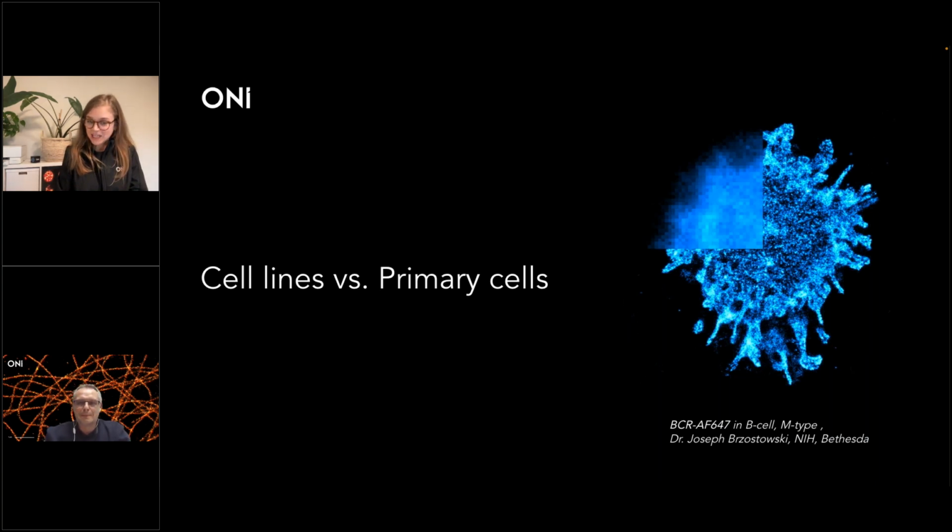Talking about permeabilization, so permeabilization is only for fixed cells. Don't permeabilize your live cells, please. Can I use permeabilization with dSTORM, or is there any concern that it will maybe damage my structure of interest?